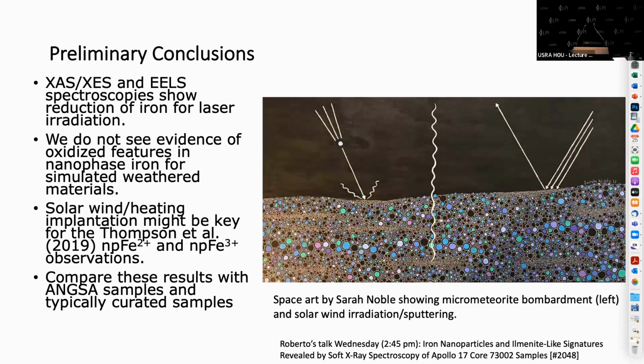And another comment is that I'm wondering how it affects the magnitude of the difference between your befores and afters. So just another thing to think about. Yeah, we want to be able to quantify that better. That's something we're working on, to quantify the difference to get an understanding. Yeah, we wrestle with that at K-edge. We sometimes end up normalizing at 3 different places in the spectrum to get them to act right. So you might want to think about that. Okay, thank you.